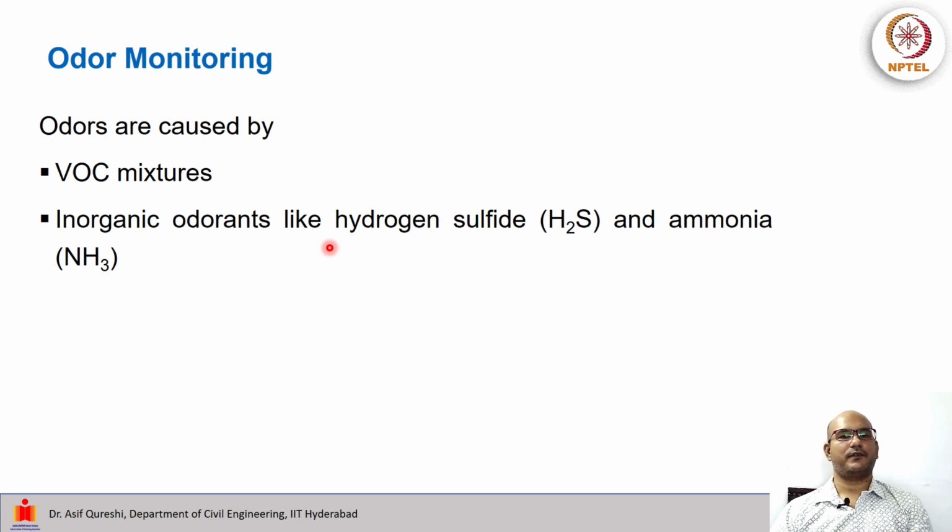After this, we have sort of a class we would say odor monitoring. Here, this is to detect odors caused by different VOC mixtures or inorganic odorants like hydrogen sulfide, H2S, and ammonia.